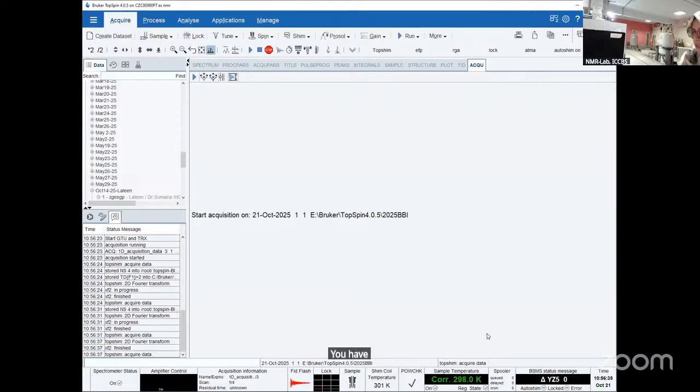You have to wait 1 minute or a little more than that to let it complete.